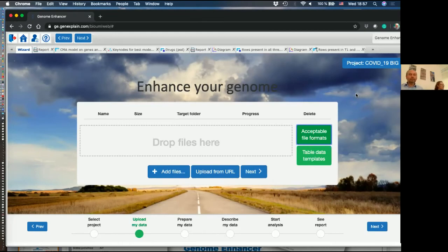And I think this approach to upstream analysis is absolutely unique to geneXplain. The first step, the analysis of promoter sequences or gene regulatory sequences for transcription factor binding sites, is done with analysis of DNA sequences, with a search for potential binding sites and even combinations of binding sites. And this is very unique, our approach.